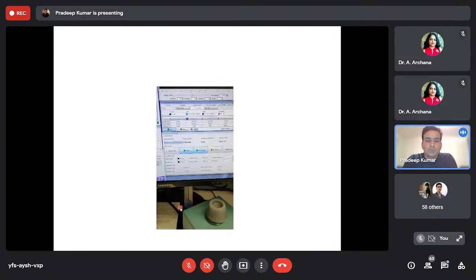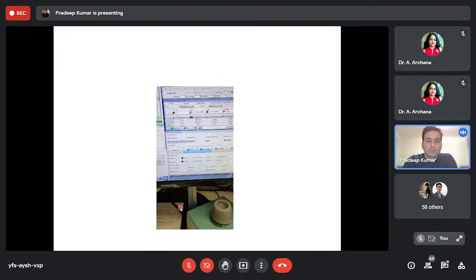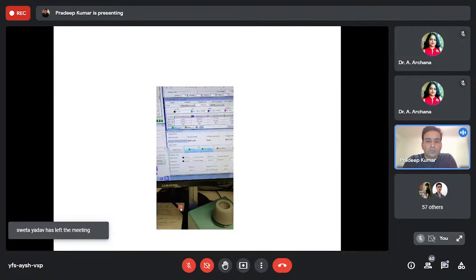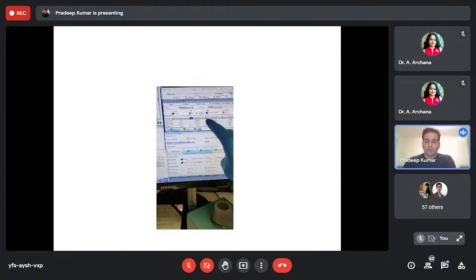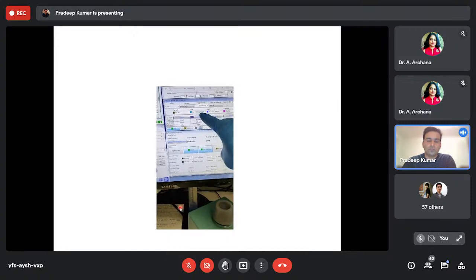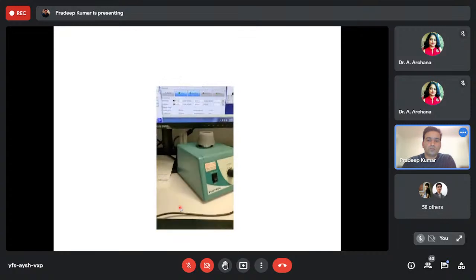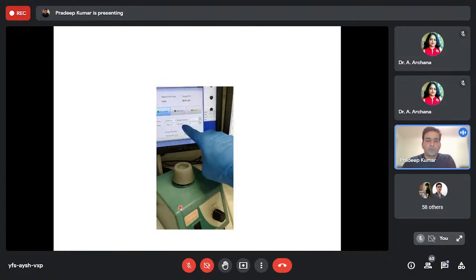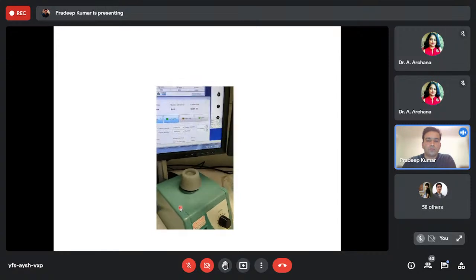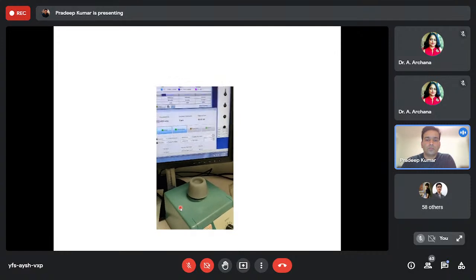You can sort into different types of devices, like a 96 well plate, 384 well plate, a flask, different tubes, Eppendorfs. At the moment we are sorting 4 populations, and of each we want a maximum of 400,000 cells. Once it reaches 400,000, it will stop on its own. That's the time it is taking. That's the flow rate of the sample. At flow rate of 1, it normally aspirates 18 to 20 microliters of your sample.